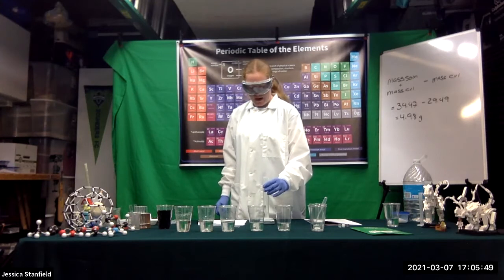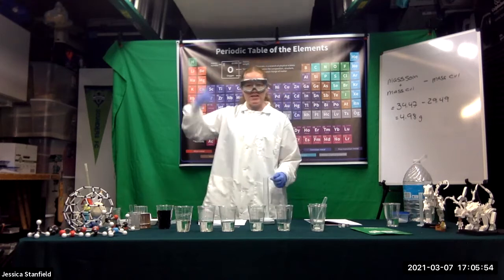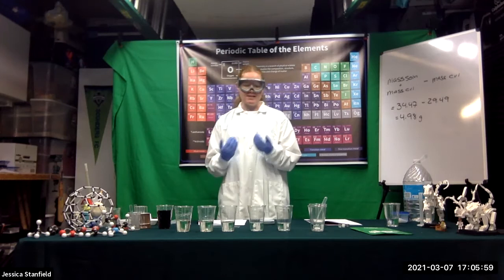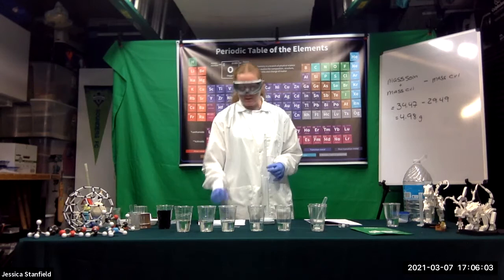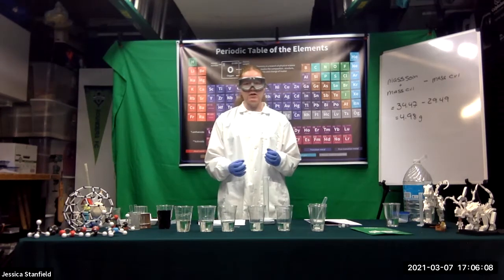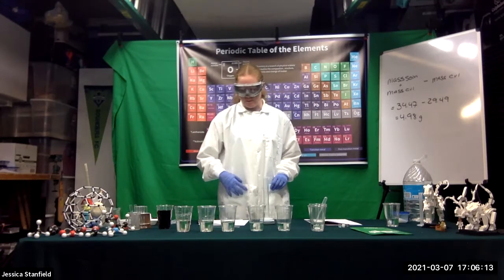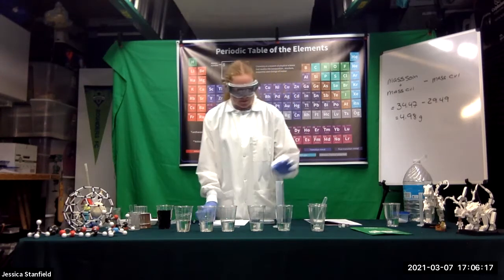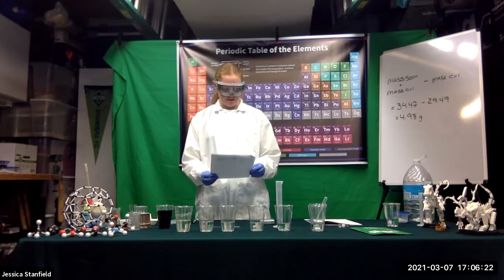And then after you pour it out, reweigh it for your 10% sucrose solution. So when you pour it out, try to shake it out to get as much of the excess water out of it as possible. That way you're not diluting your next solution, okay? And then you'll get a mass of the cylinder before you add any of the 10% sucrose solution. You'll use that same mass for that 10% like we did for our 0%, and we'll get all of those readings. Okay, and so you're going to do that for the 0, 10, 20, 30, 40, 50, and 60% solutions.